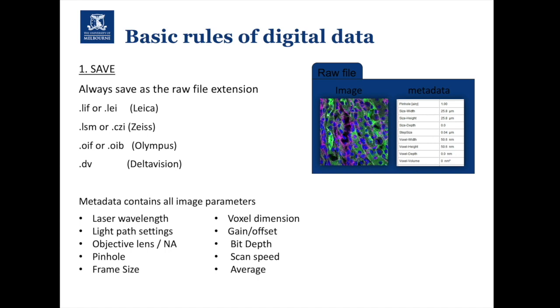The other nice thing about this is a lot of the softwares also allow you to reuse those settings again on another day. So you can be imaging the exact same way many days, weeks or months apart.